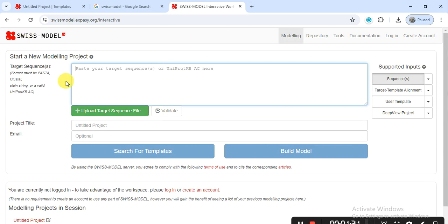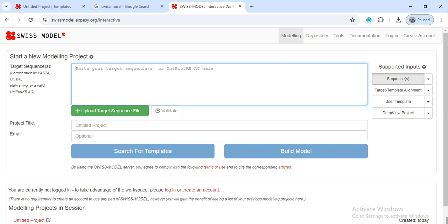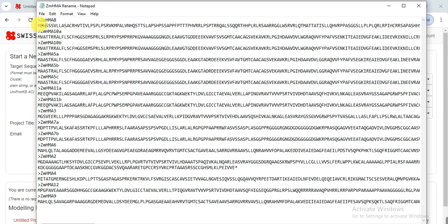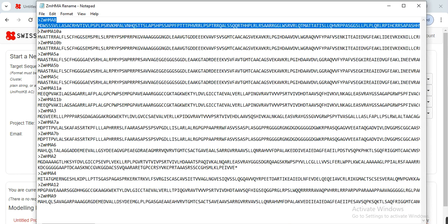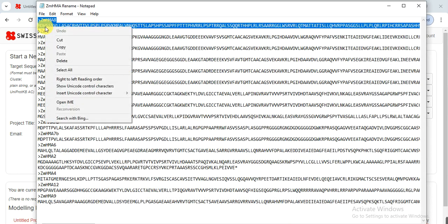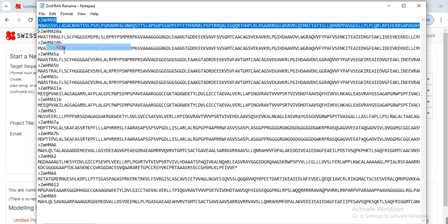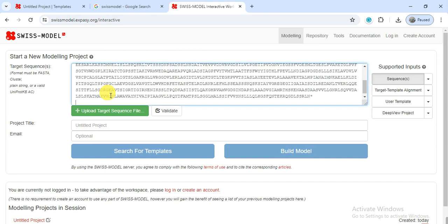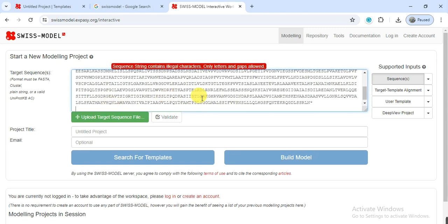Then you will see this type of window that has a box. Now you need to open that file containing the protein sequence of your gene and then select the gene or any from your family and you can select it one by one. First I copy the sequence of one of my genes and then here I paste it. When I paste, it shows sequence string contains illegal characters, only letters and gaps allowed.